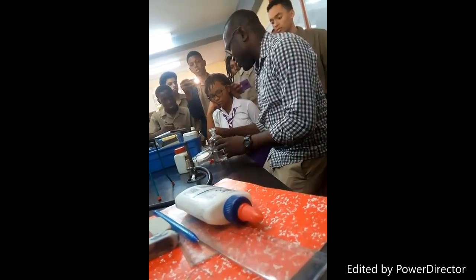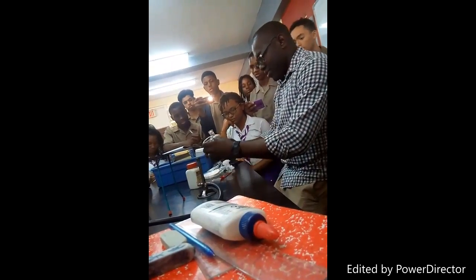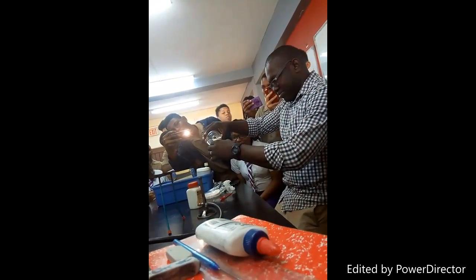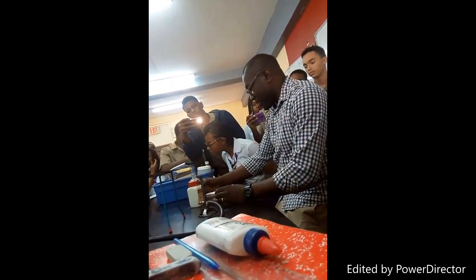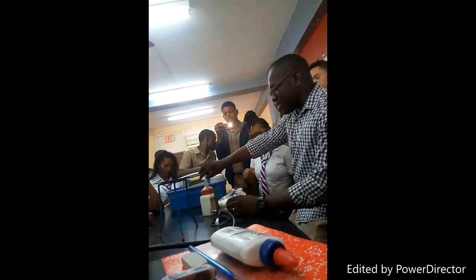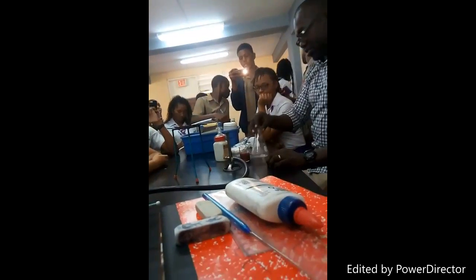Sir, so are we going to get the blue thing from yesterday? And so we pour on some of this. Nothing special is going to happen. We need to stir around. Look in that white thing there, you see a glass rod? A glass rod? Yes.